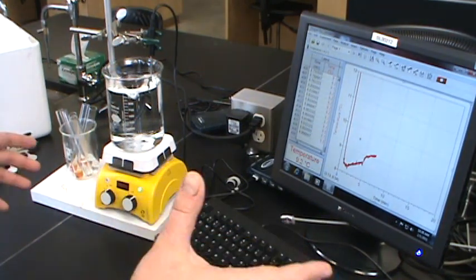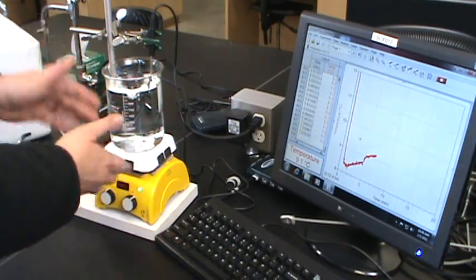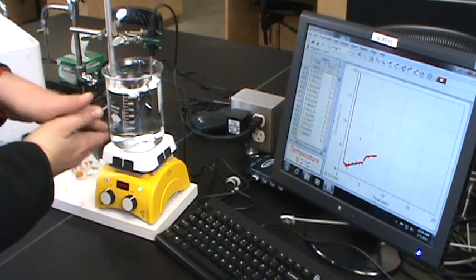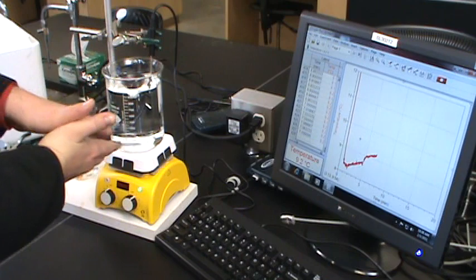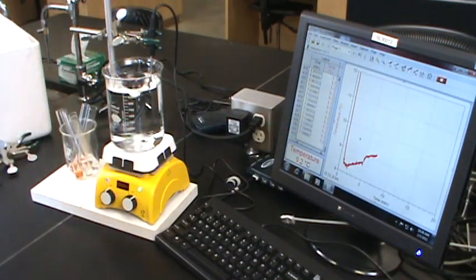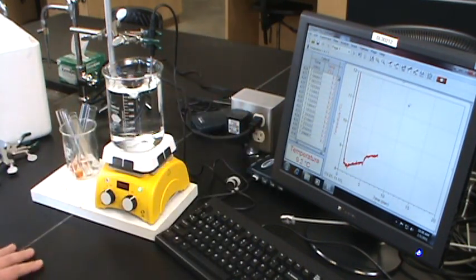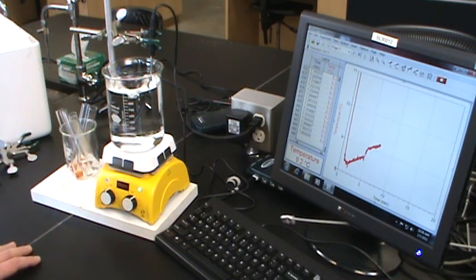So the heat is transferring from the room into this cold water, but because the heat capacity is so high, because it takes so much energy to change the temperature of this sample, we can have a fairly stable temperature as we run our experiment. So we're coming up a little bit closer, and since we're doing that, let me expand this graph even more. I'll run it from 11 down to 9.